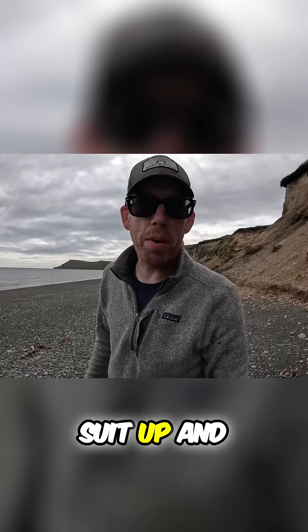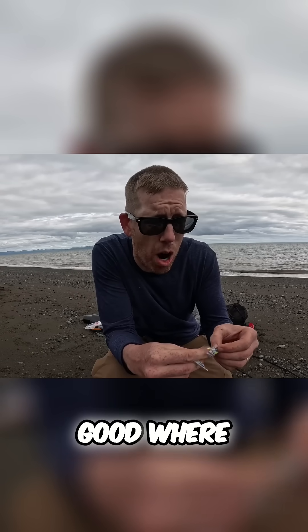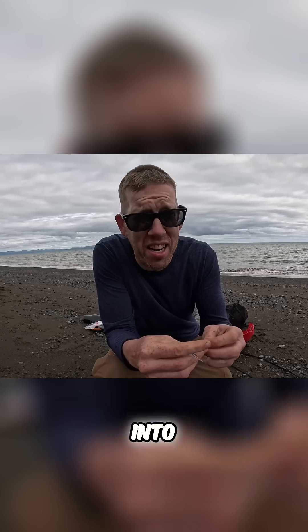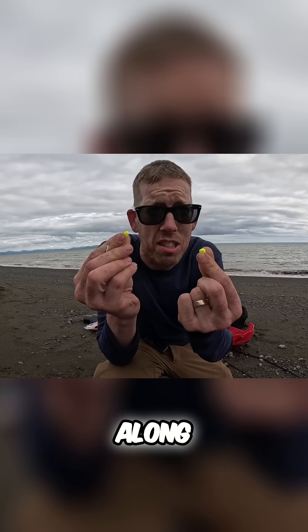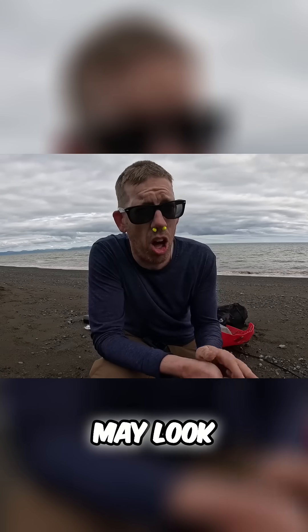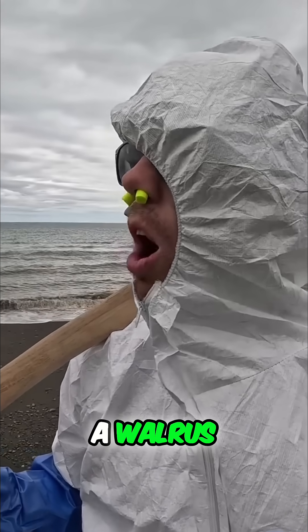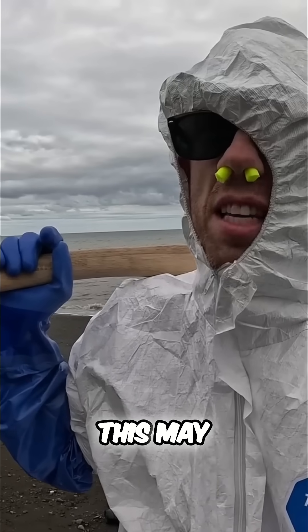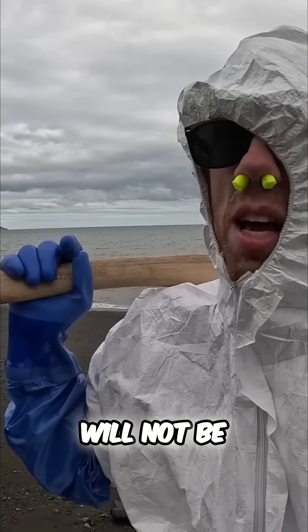Feeling cute — I think it's time to suit up and do the dirty job. I'll be honest, it doesn't smell very good where I'm sitting, and once I cut into that carcass it's gonna get much much worse. So I brought along some earplugs — may look ridiculous but it's worth it. Feeling cute, might go cut up a walrus. This may seem like overkill, but anything that gets rotted walrus on it will not be allowed back into my house.